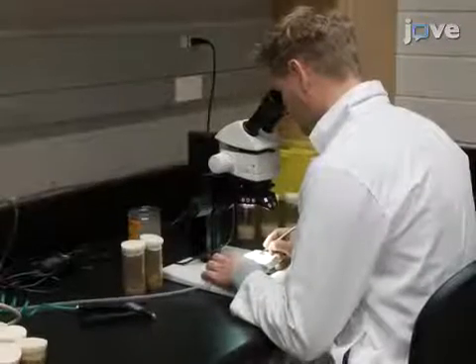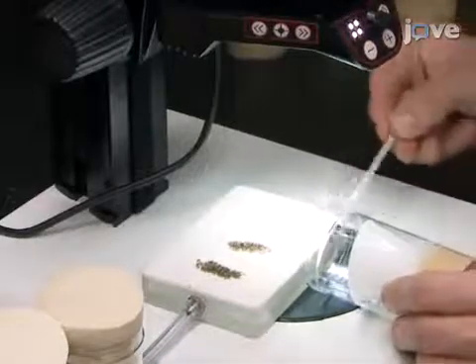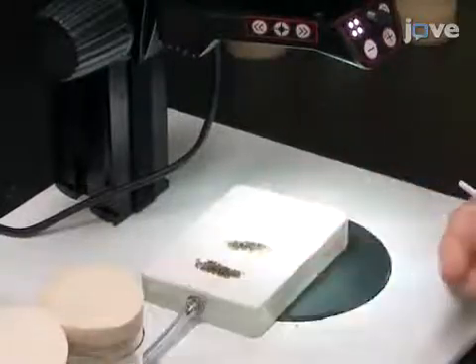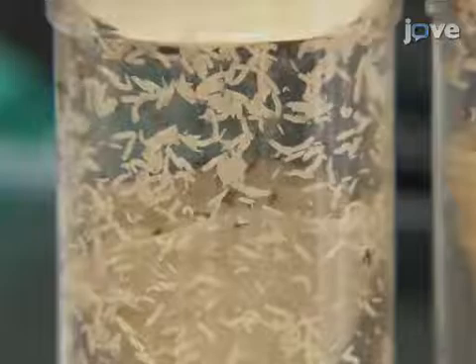Eleven days in advance of collecting the experimental male flies, start 5 to 20 wild-type cultures, each containing a mixed-sex population of 60 to 100 flies. Prepare each culturing vial using power food with a piece of filter paper to expand the surface area for pupation. Using power food is an essential step to producing large numbers of premated females.